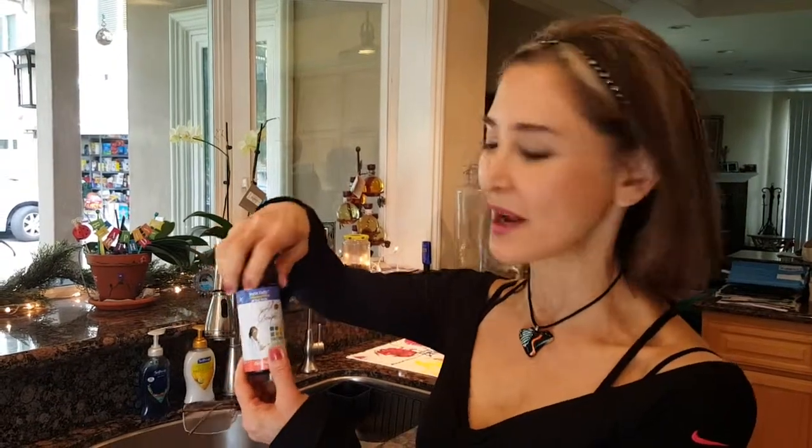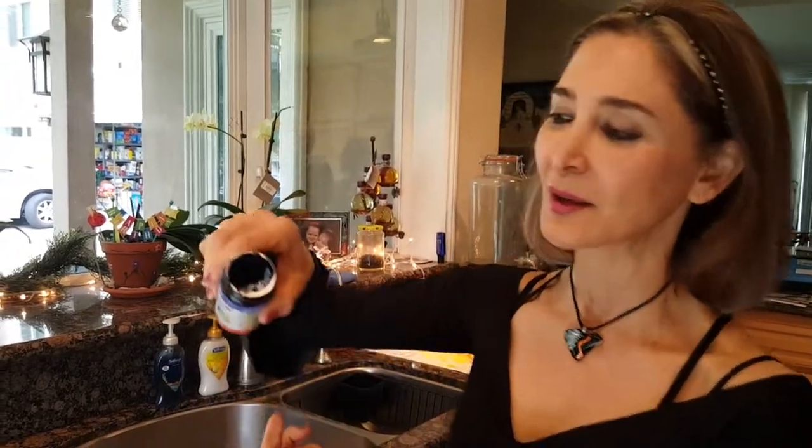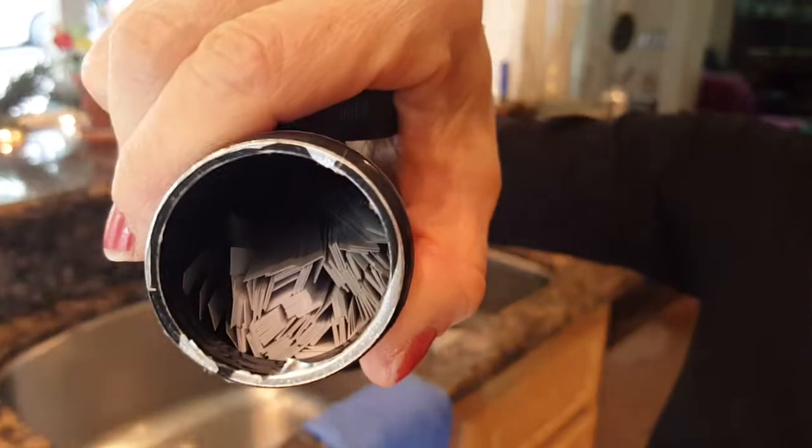Good morning. Today we are testing the pH of water and we're going to use my pH strips — you can order these on Amazon. The reason why we're doing this today is because I'm getting emails from people saying they think the pH strips don't work because their water is very acidic. So I thought, wow, I need to check it out.